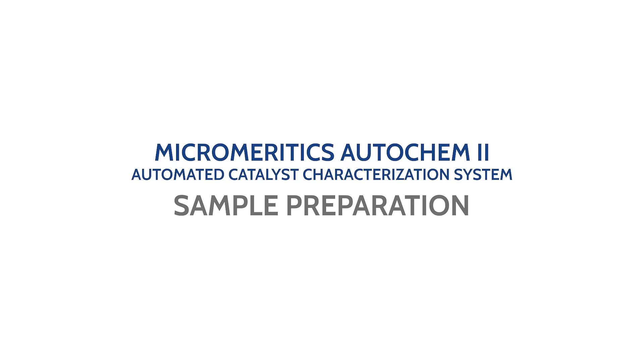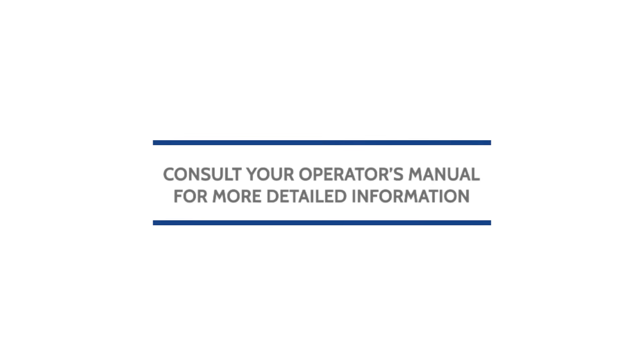This video will show you how to prepare and load the sample tube for chemisorption analysis on the Micromeritics AutoChem II automated catalyst characterization system. Remember to always consult your operator's manual for more detailed information.